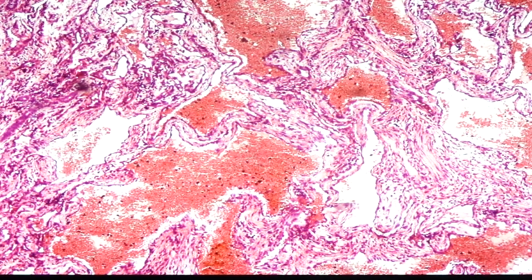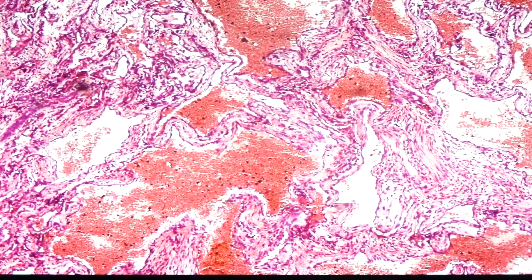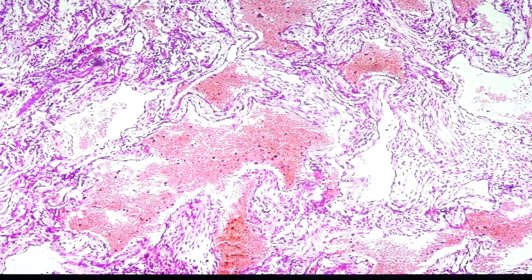The hemangioma would be composed of blood vessels. It can be small like capillary or they can be large like this one. This can be what we call cavernous hemangioma if we would see large spaces like this one. Because these are blood vessels, they are lined by endothelial cells, which, if you remember histology, are simple squamous cells.